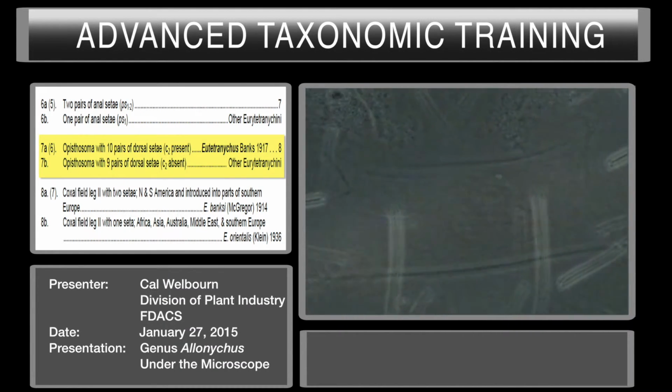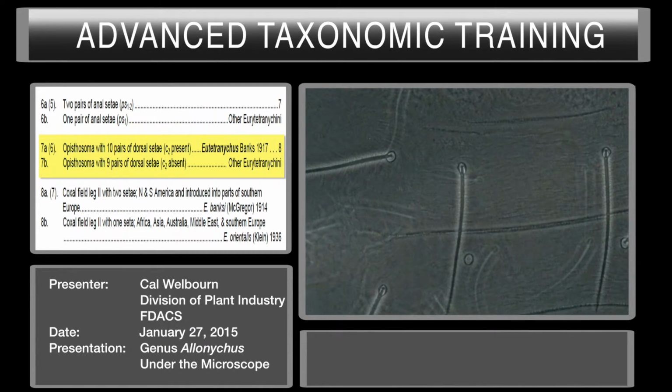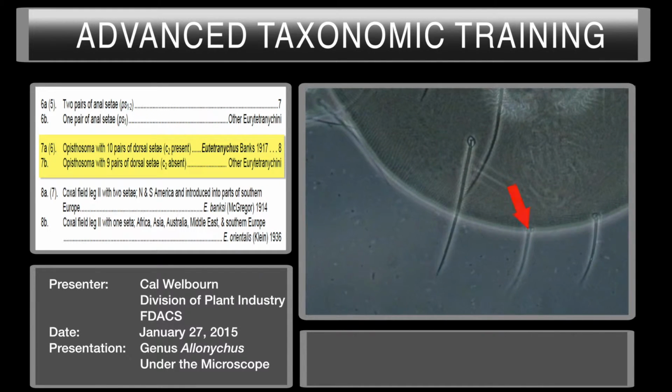Now we can just count the CD. 1, 2, 3. This one on the edge here, the C3. Now we're going to move down to the next row. That's D1, D2, 4, 5, 6, 7, 8, 9, 10. 10 pairs. So we have 10 pairs, and C2 is present. So we move on to the next couplet.